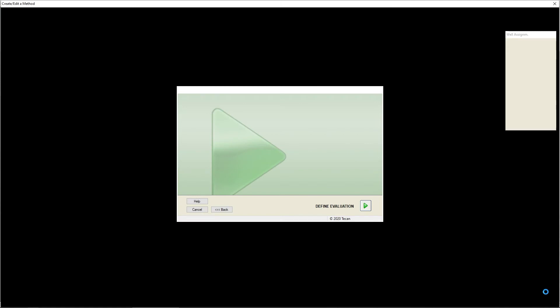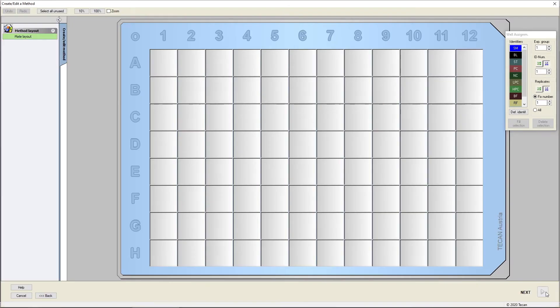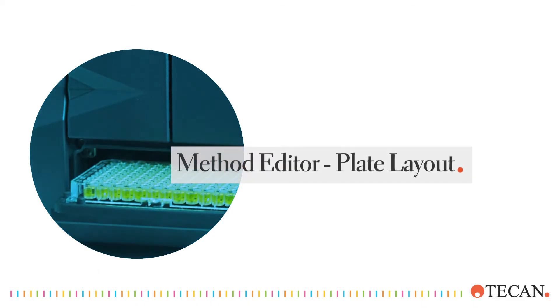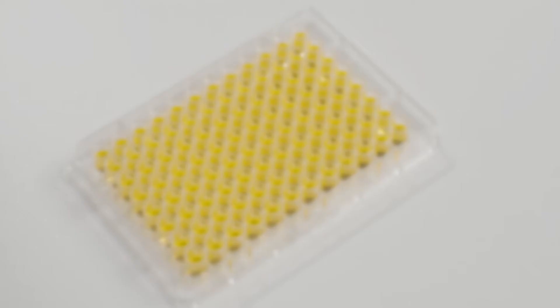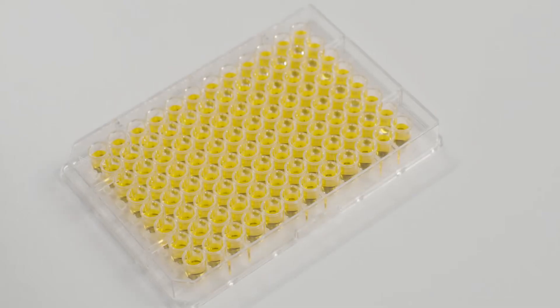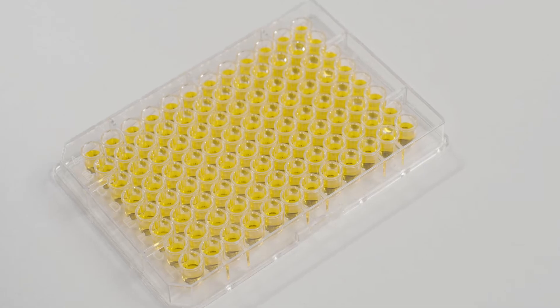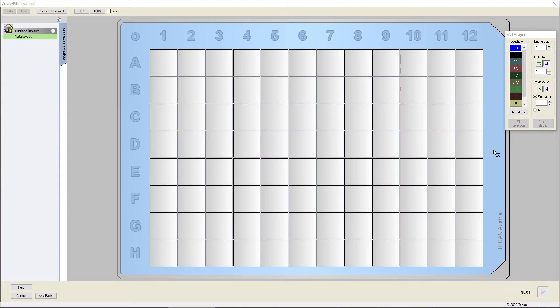From here, the software setup is identical for all Tecan readers. Define the plate layout of the liquids used in your assay according to the protocol, and use a blank to normalize background signals that are not coming from your analyte.